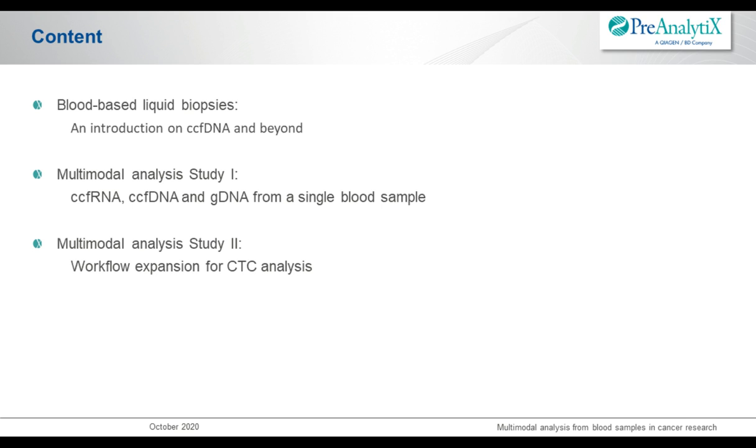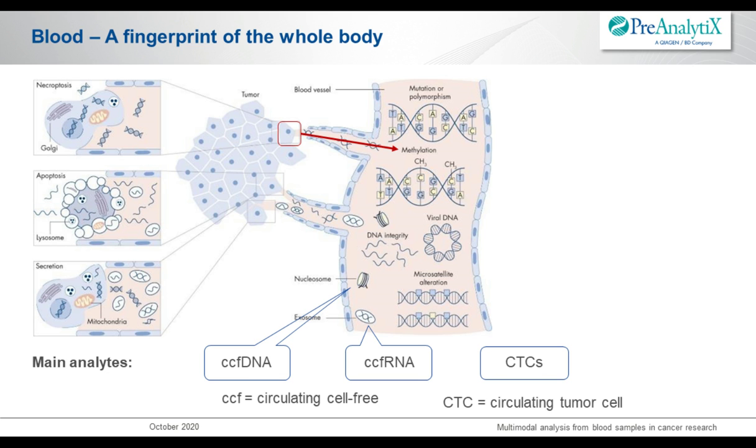And then in the next 2 parts of the talk, I will give you a short summary of 2 very recent studies that we have done, where we focused on the multimodality and analysis from liquid biopsies. So in the first part, we look at a study where we looked on ccfRNA, ccfDNA, and gDNA from the same single blood sample. And in this final part, I will show you a study where we expanded this workflow to CTC as well.